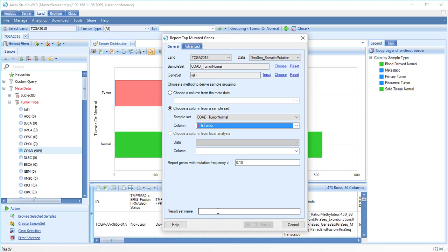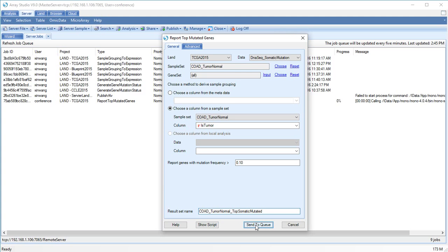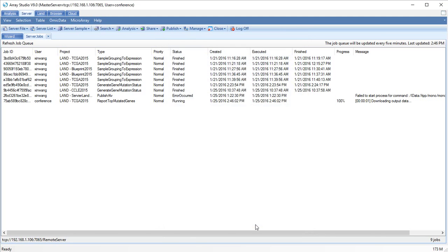And give our set a name. Now let's send our analysis to the queue. These analyses can take a while, but you can monitor progress in the Server Jobs tab.